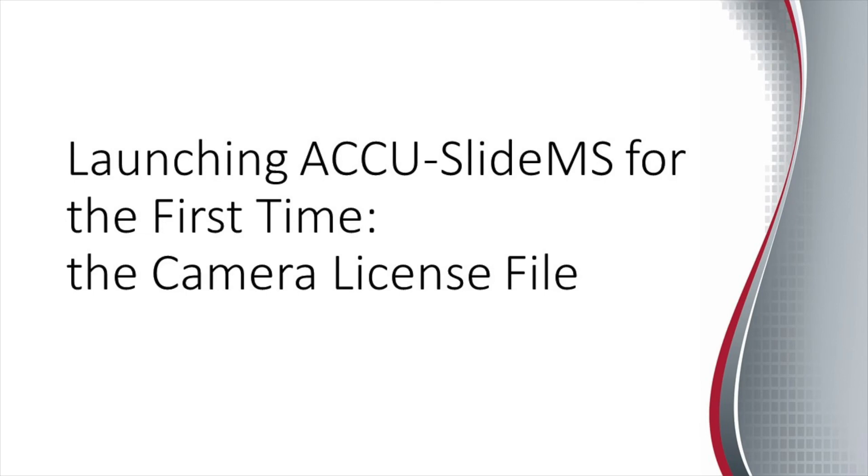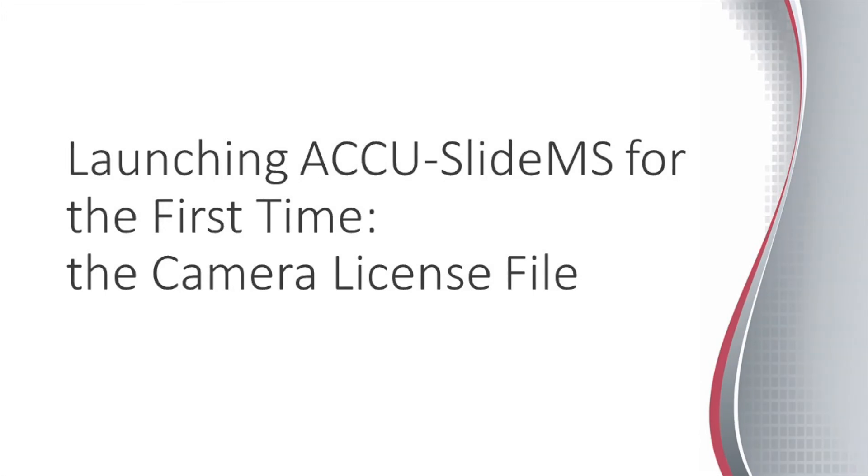You should have received the camera license file from your AccuScope dealer. If you did not, please contact your dealer again. Save the camera license file to a location on the PC that you will remember. In this example, the file was saved to the desktop.